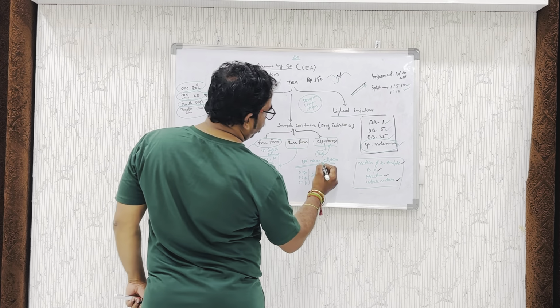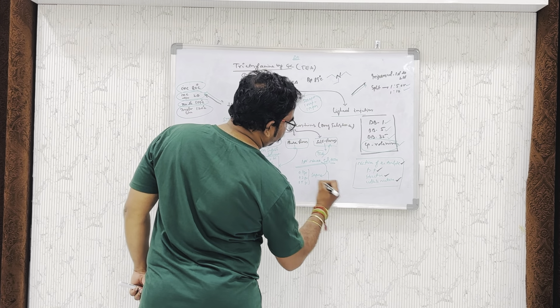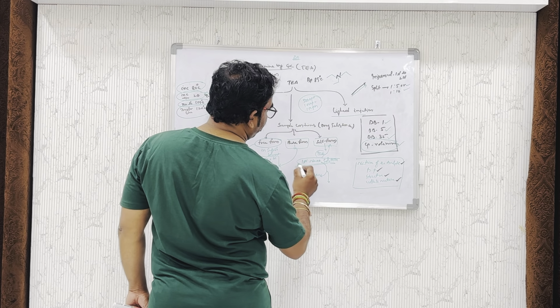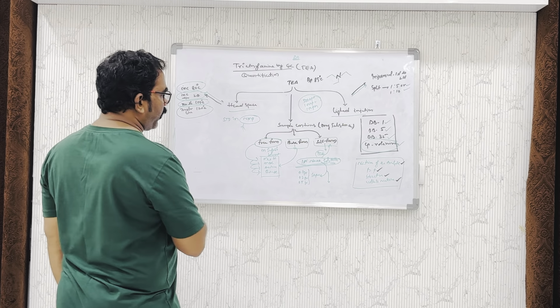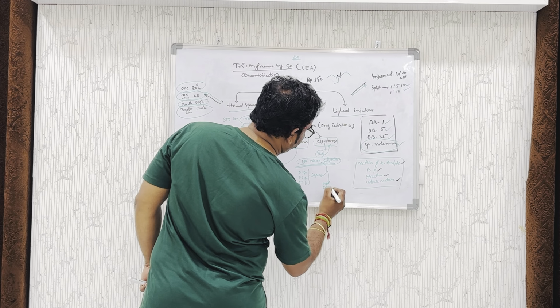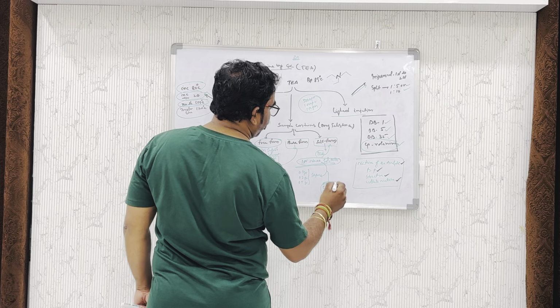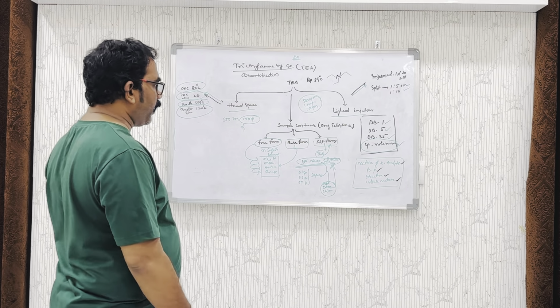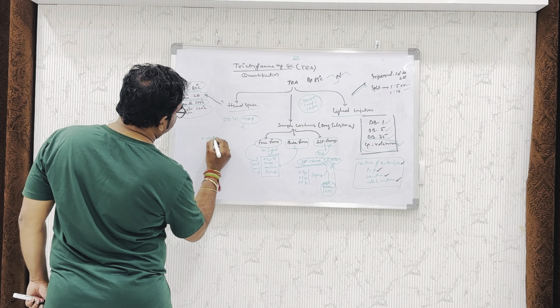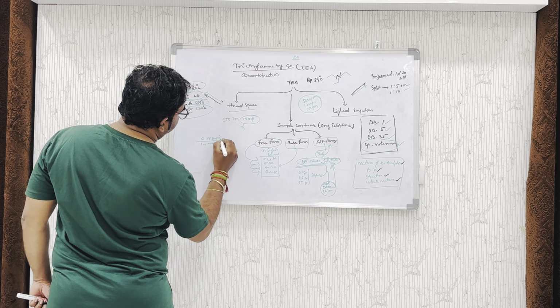Initially, the sample we need to dissolve in 1 normal sodium hydroxide, then we can extract with a suitable solvent. That suitable solvent we compulsorily need to separate from sodium hydroxide. Here we can consider MDC or ethyl acetate or chloroform, because these three solvents will separate from the NaOH solution. Okay. Now you can take the sample. How to extract? You take the sample, then you dissolve it in one normal NaOH. It will completely dissolve the sample.